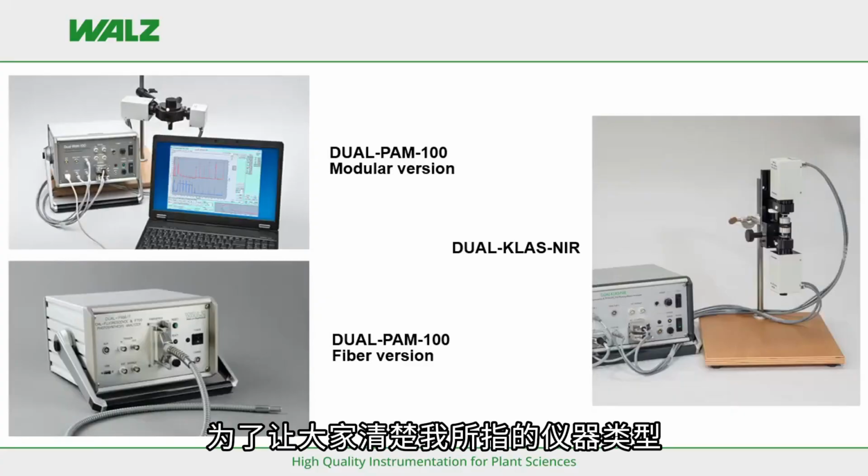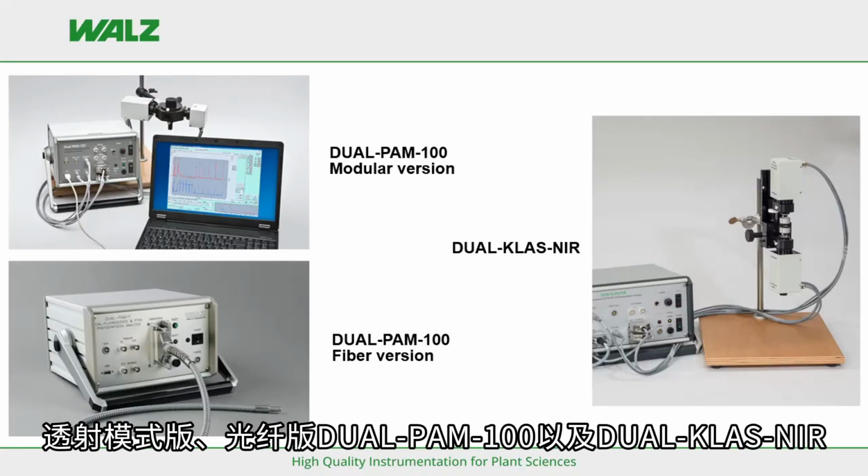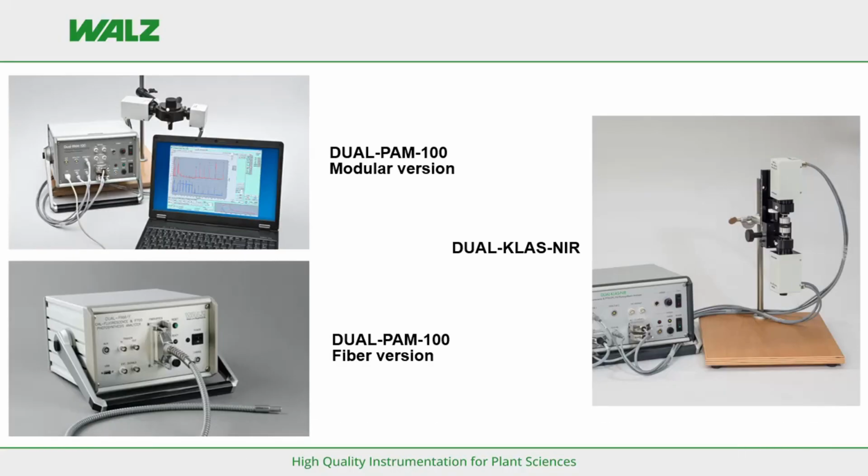Just to show you which instruments I am referring to, photos of the three instruments, modular and fiber version of DUAL-PAM-100 and Dual-KLAS-NIR, are shown.